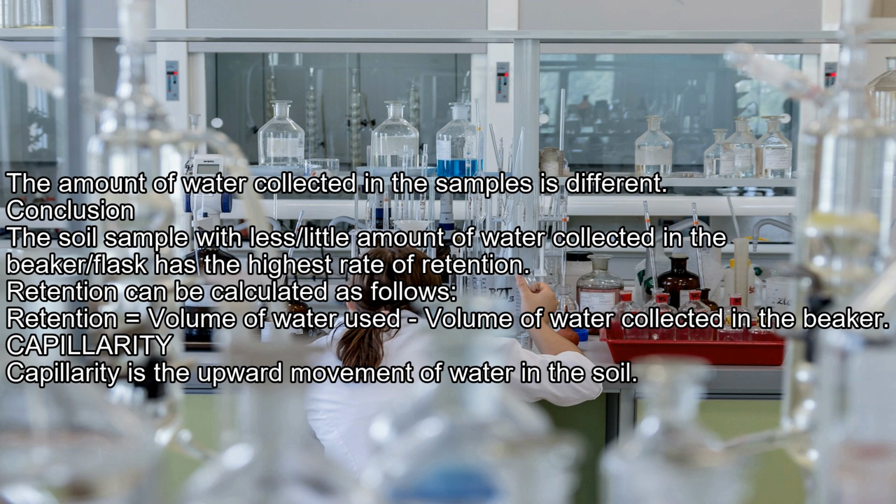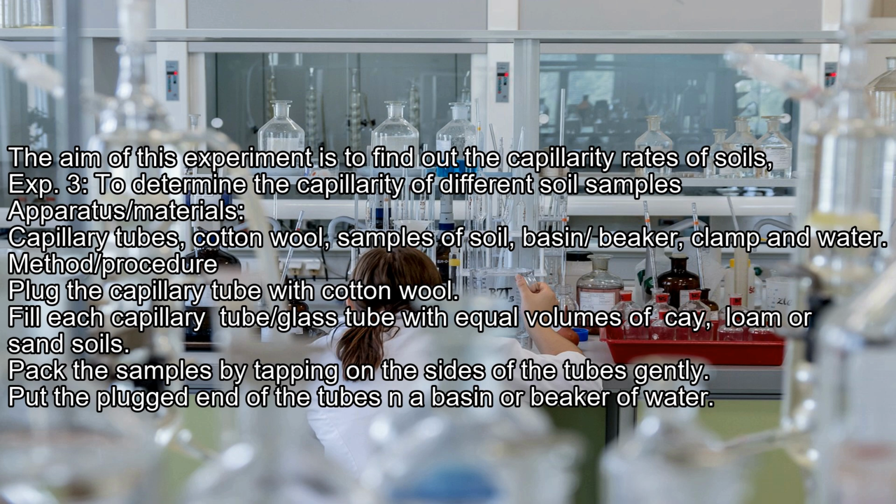Capillarity. Capillarity is the upward movement of water in the soil. The aim of this experiment is to find out the capillarity rates of soils. Experiment 3: to determine the capillarity of different soil samples.